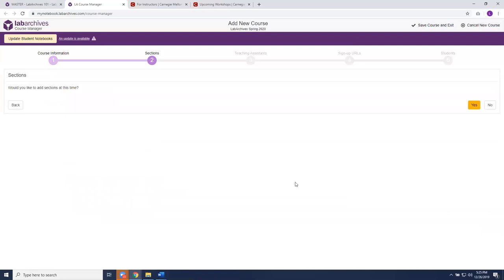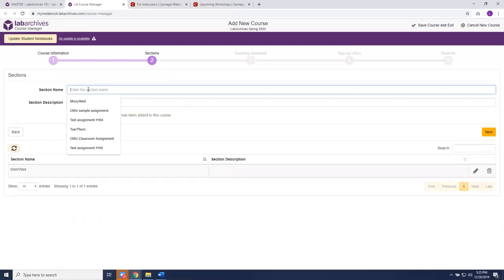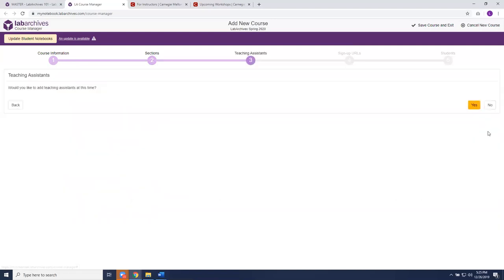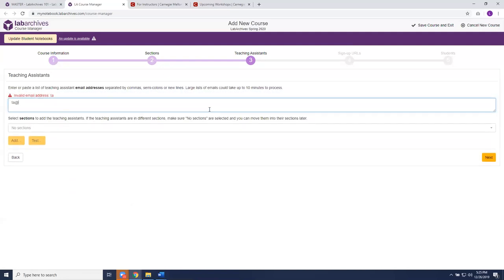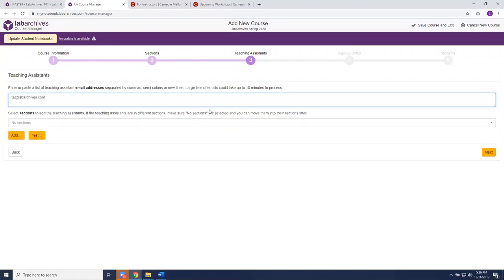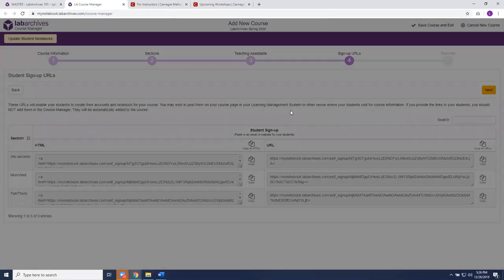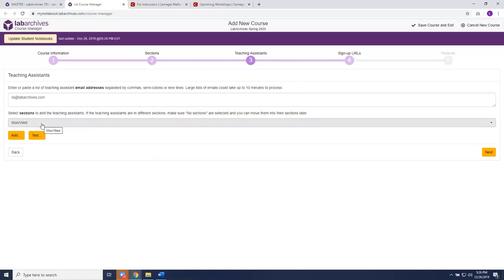That takes us to step two: adding sections. We'll add a Monday/Wednesday section and a Tuesday/Thursday section. Step three is adding teaching assistants — type the TA's email address, assign them to the right section, and click Next. You'll see that ta@labarchives.com has been assigned to the Monday/Wednesday section.